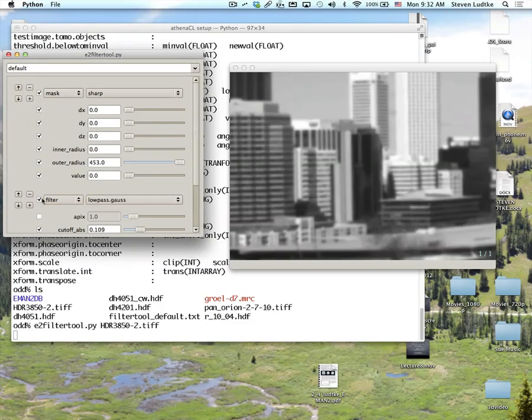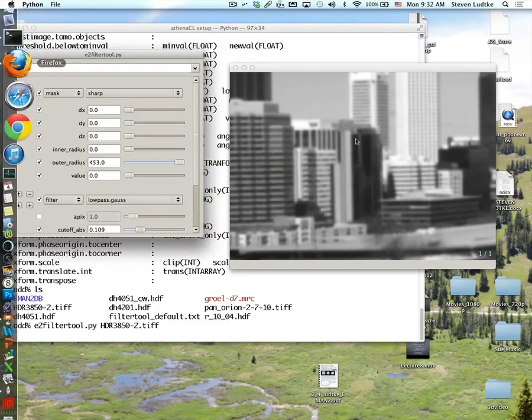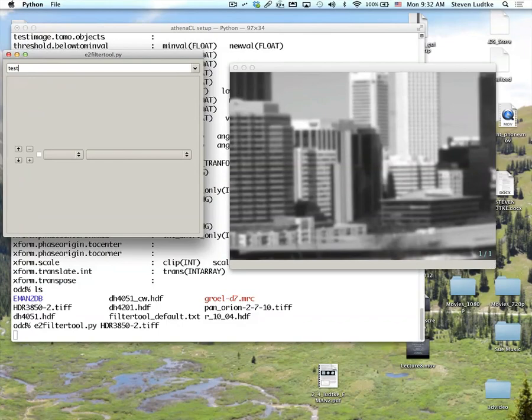And it'll open another window which allows you to add processors in sequence to it. So let me start out from scratch here. I'll make a new one. Okay, so it'll start out looking like that. I'd already done something in this directory, and it remembers between sessions what you'd set up.